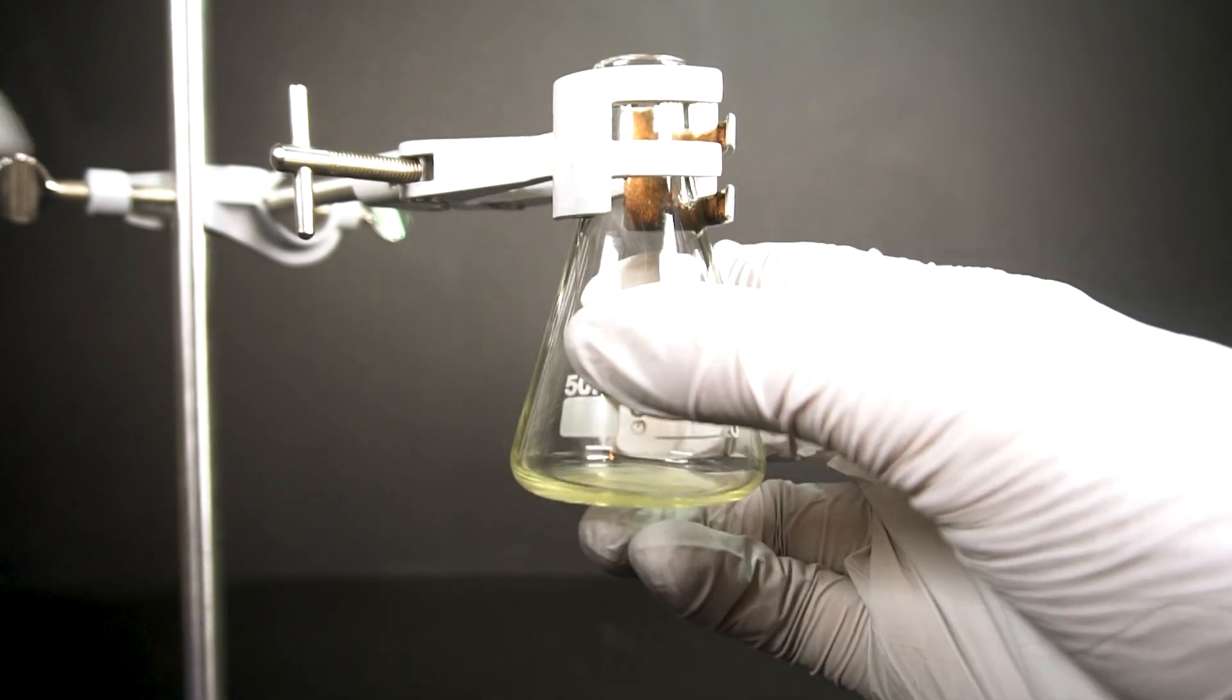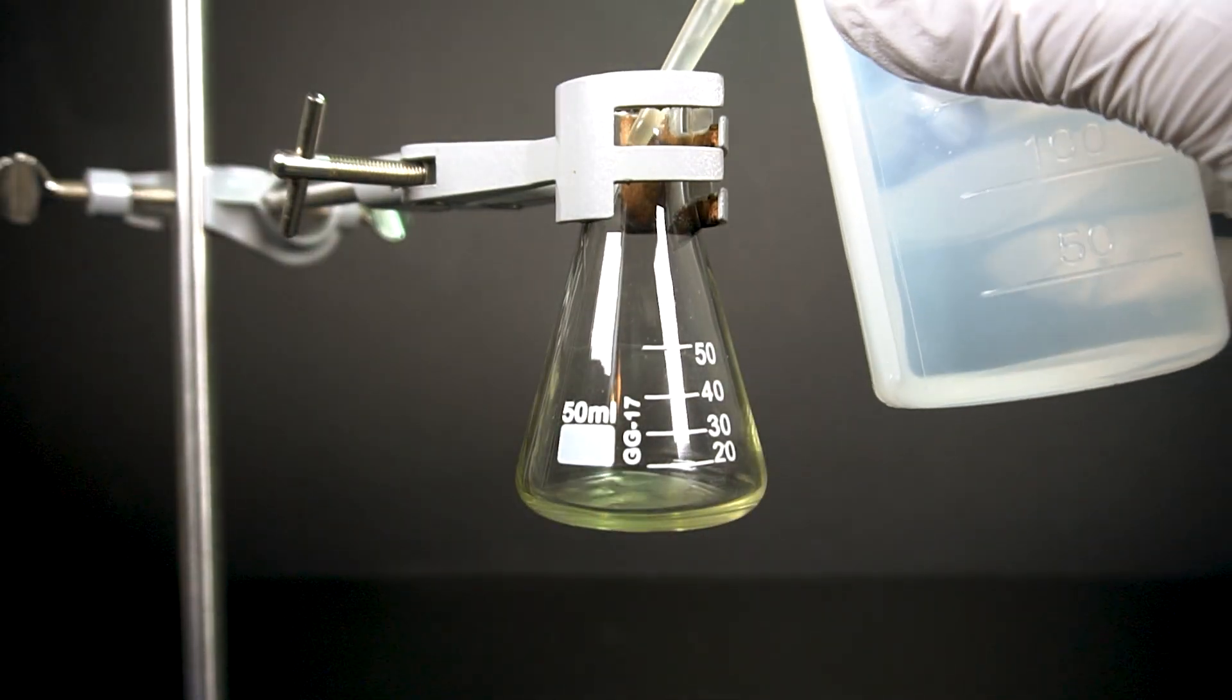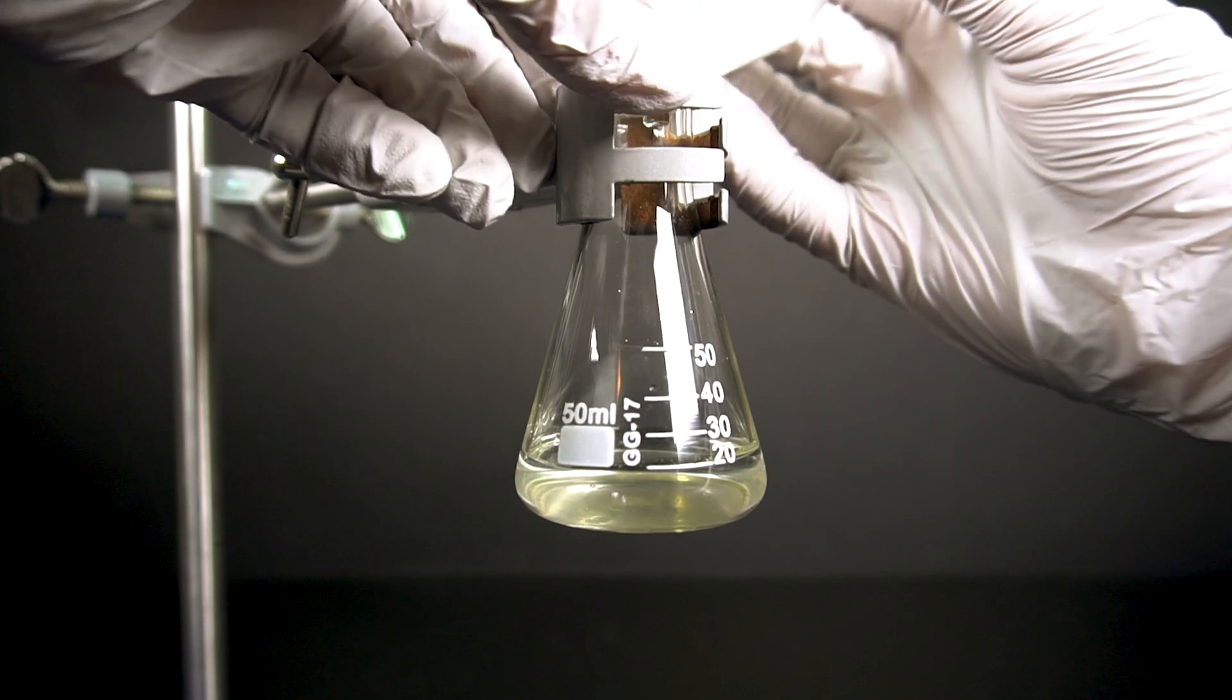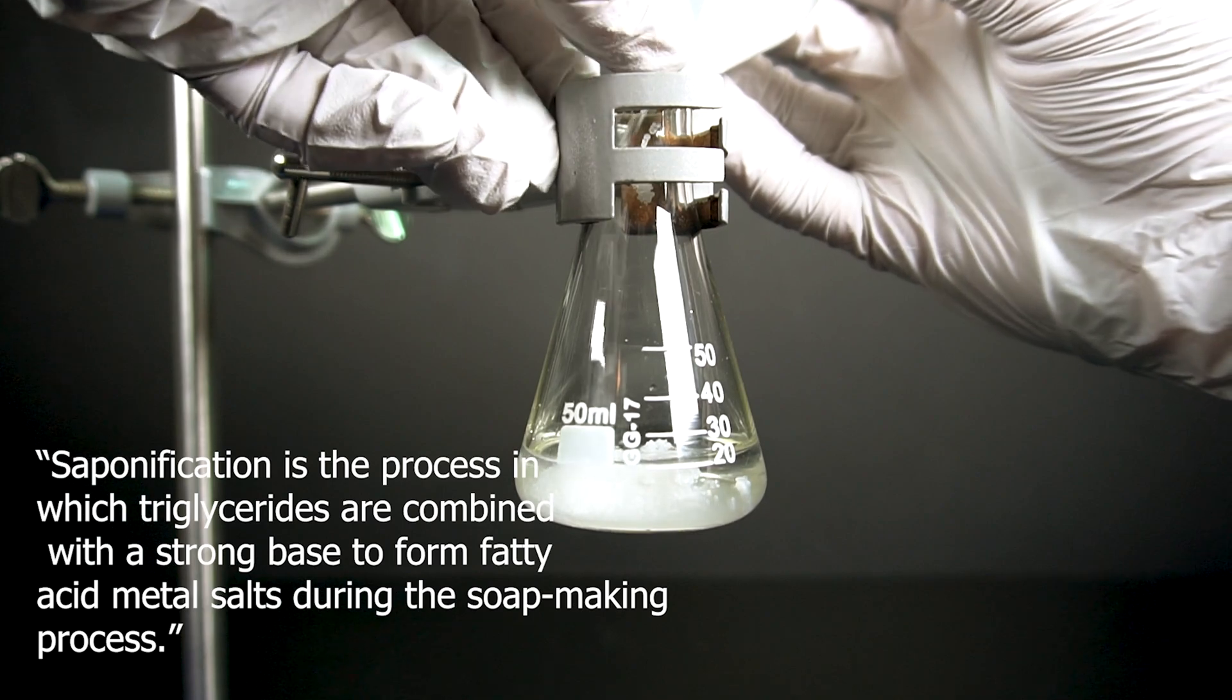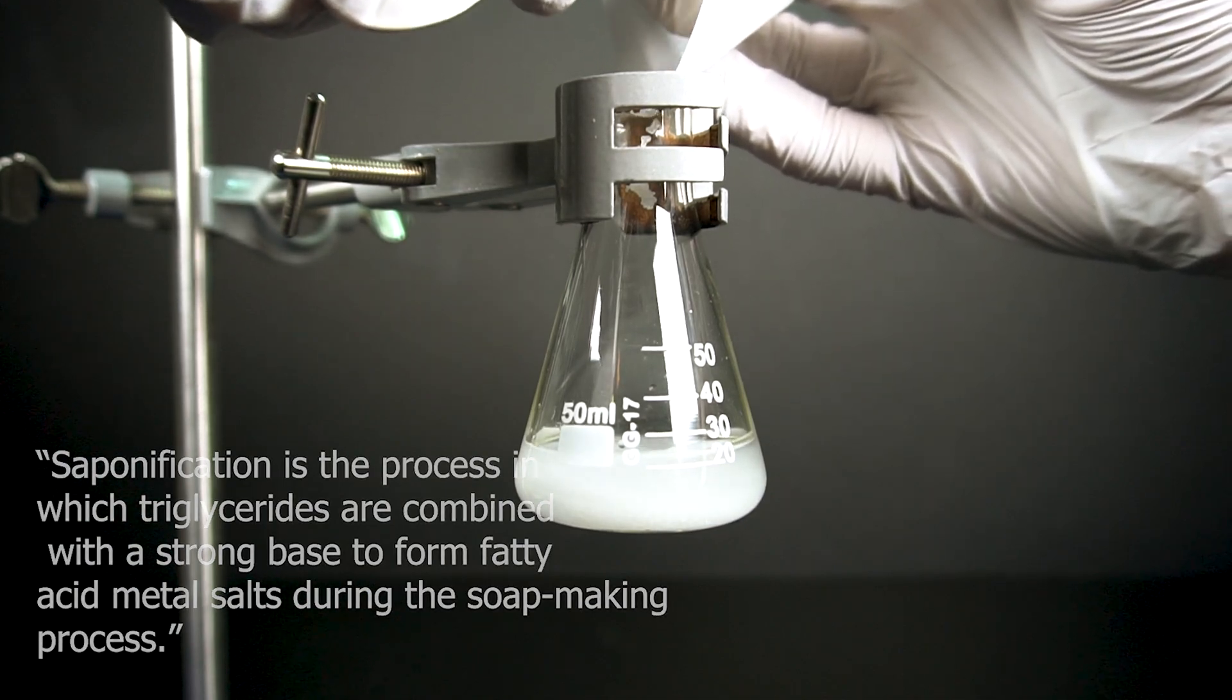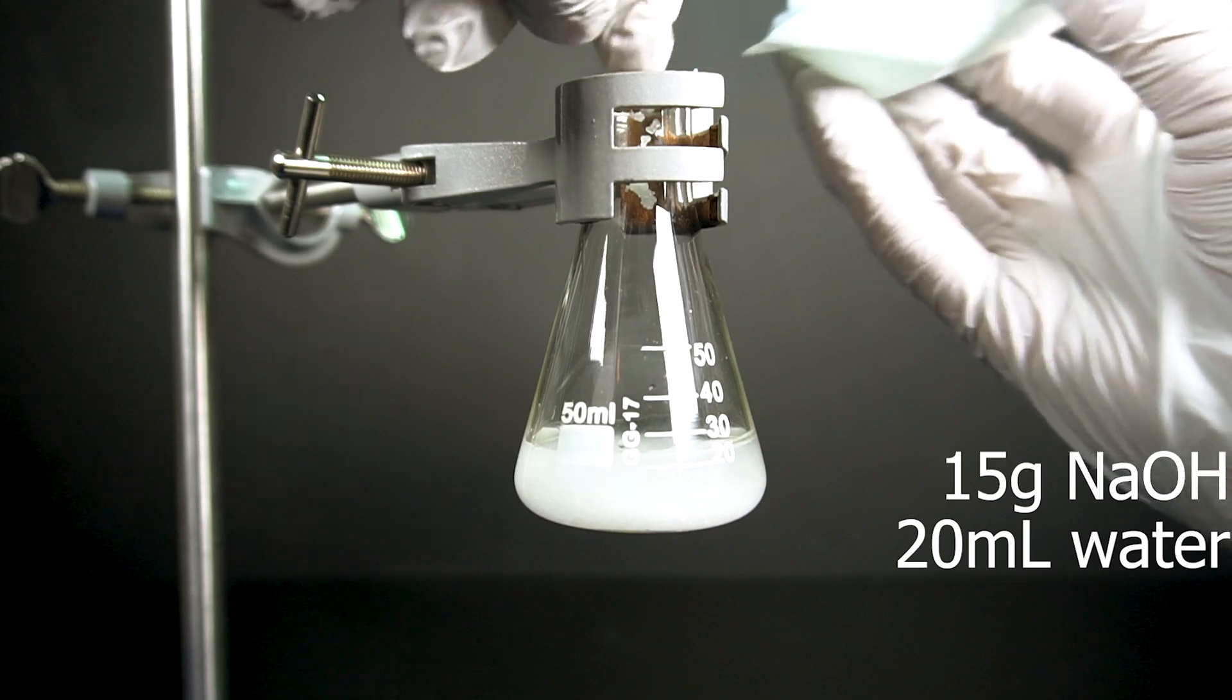The next part of the project is where things get kind of dangerous. I make an 18 molar solution of sodium hydroxide. Sodium hydroxide can cause severe burns and damage to any skin it comes into contact with. Getting drops of this strength of sodium hydroxide will instantly start turning tissues into soap through a process called saponification. To make this, I add about 15 grams of sodium hydroxide into 20 milliliters of distilled water.